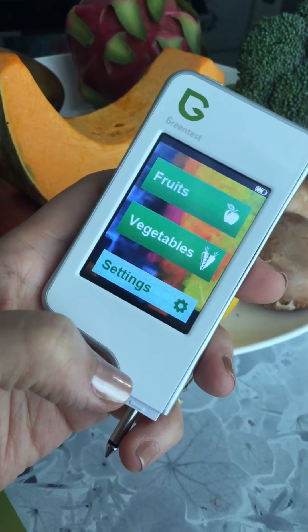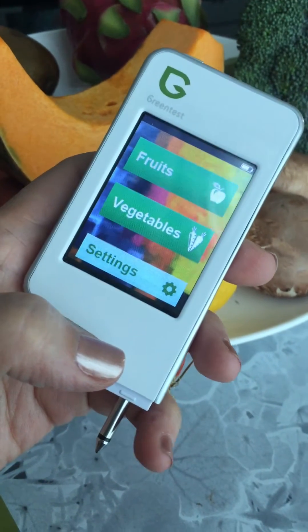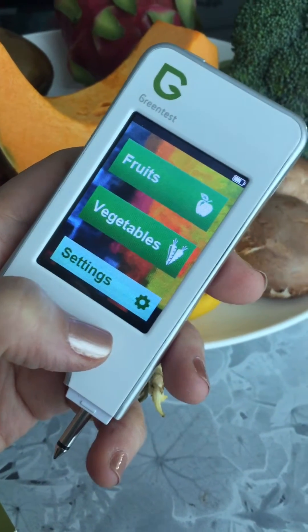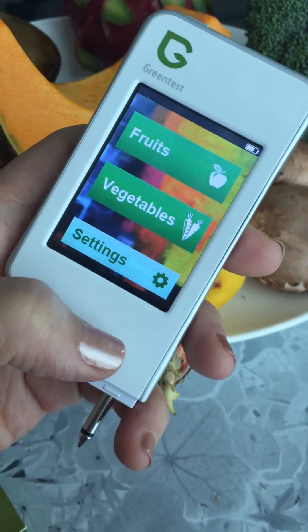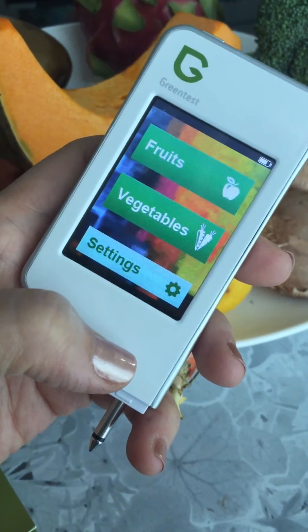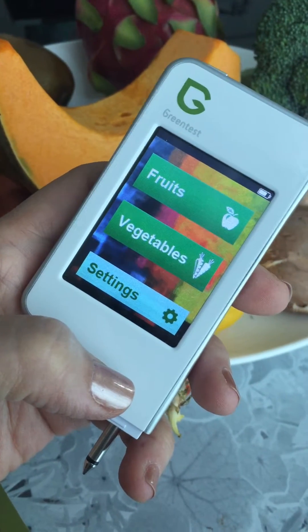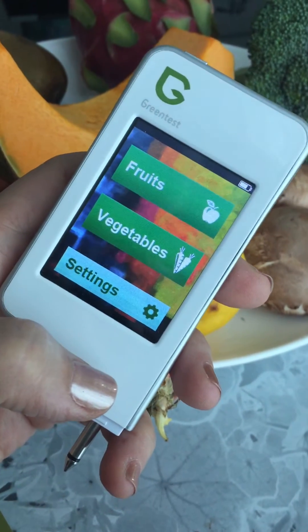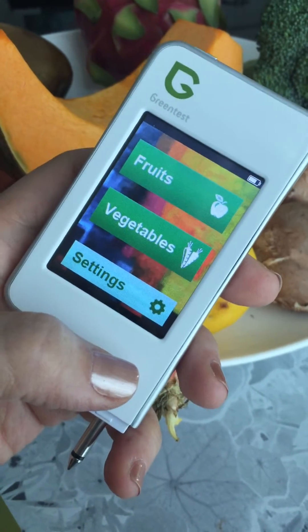In my continuing quest to eat as clean as possible, I chanced upon this gadget and bought it off Amazon recently. It's called the Green Test, and apparently it's designed to test the level of nitrates in our fruit and vegetables. The device has predetermined safe levels of nitrates. Nitrates are bad news — in food production they're used to preserve food, and they get into fruit and vegetables through the soil as well.